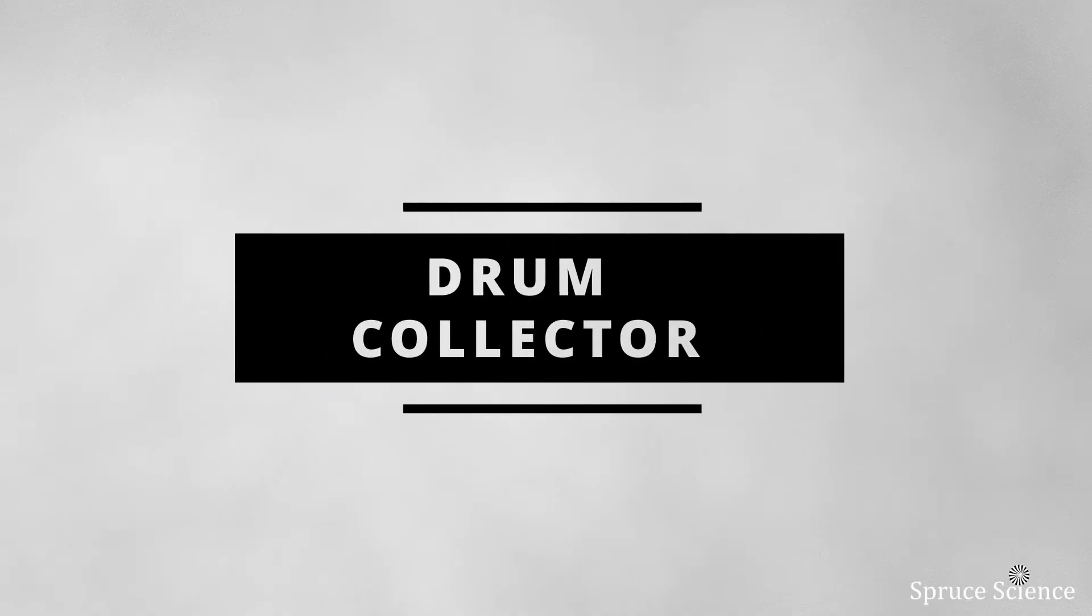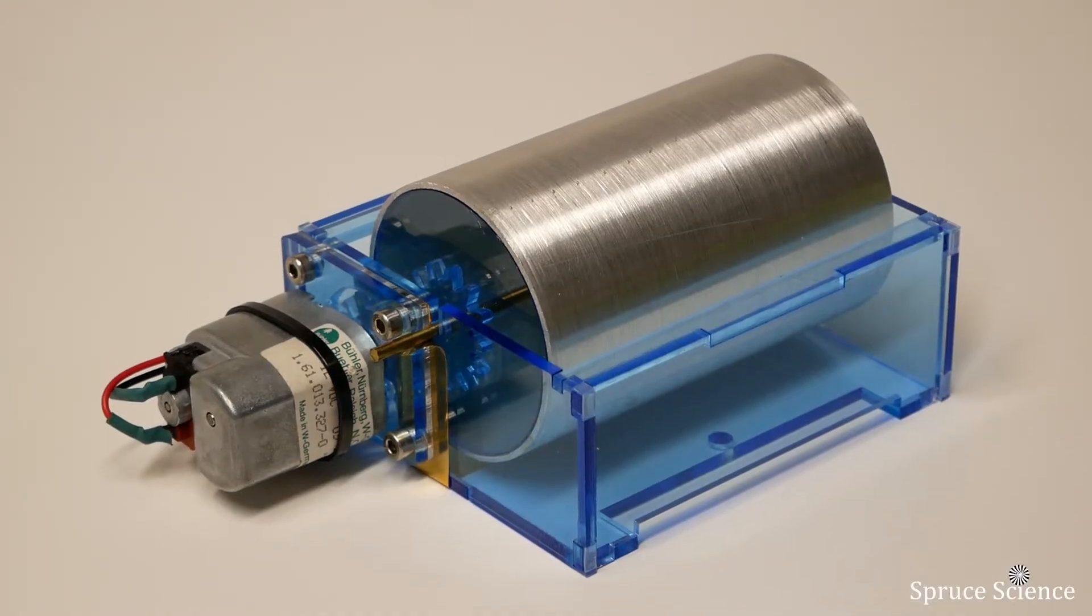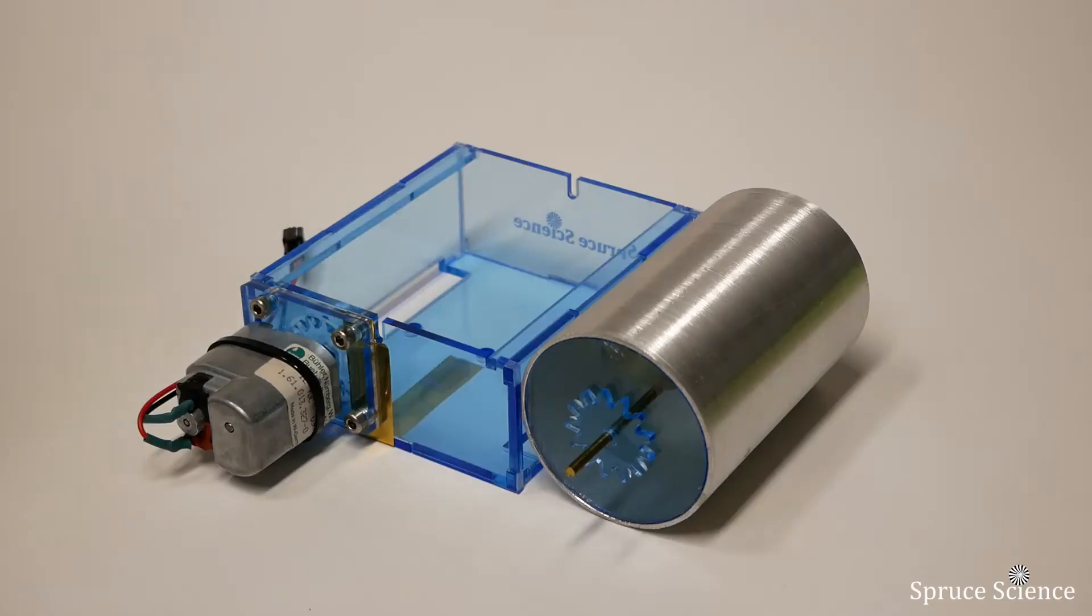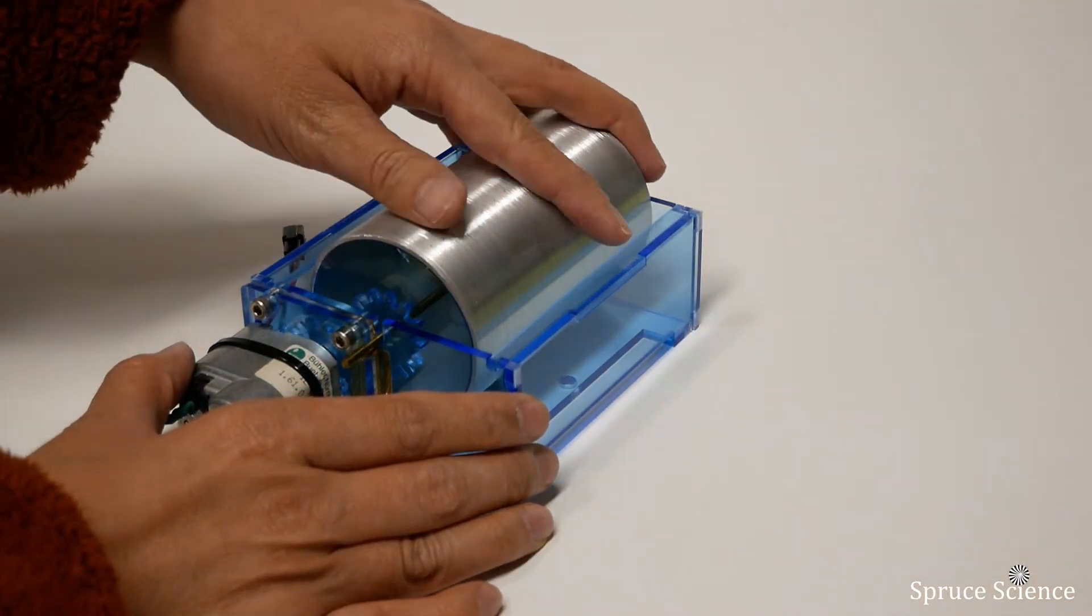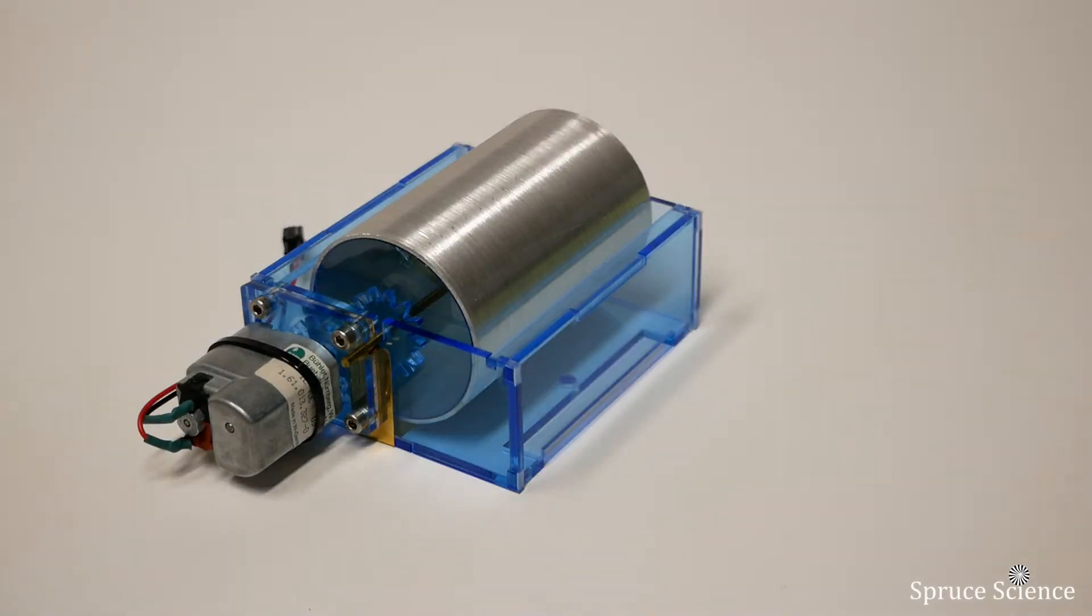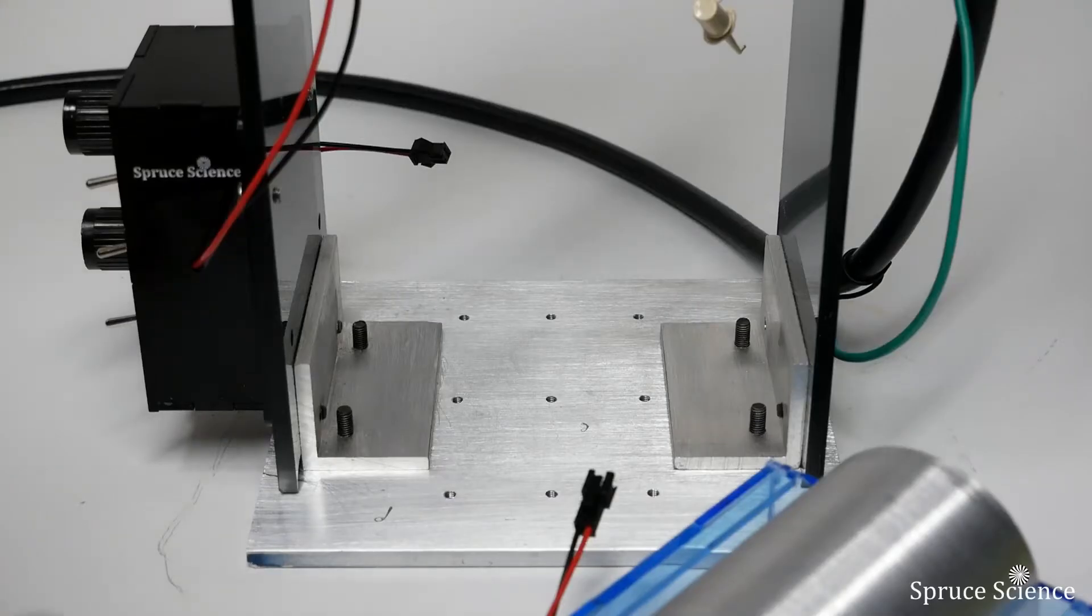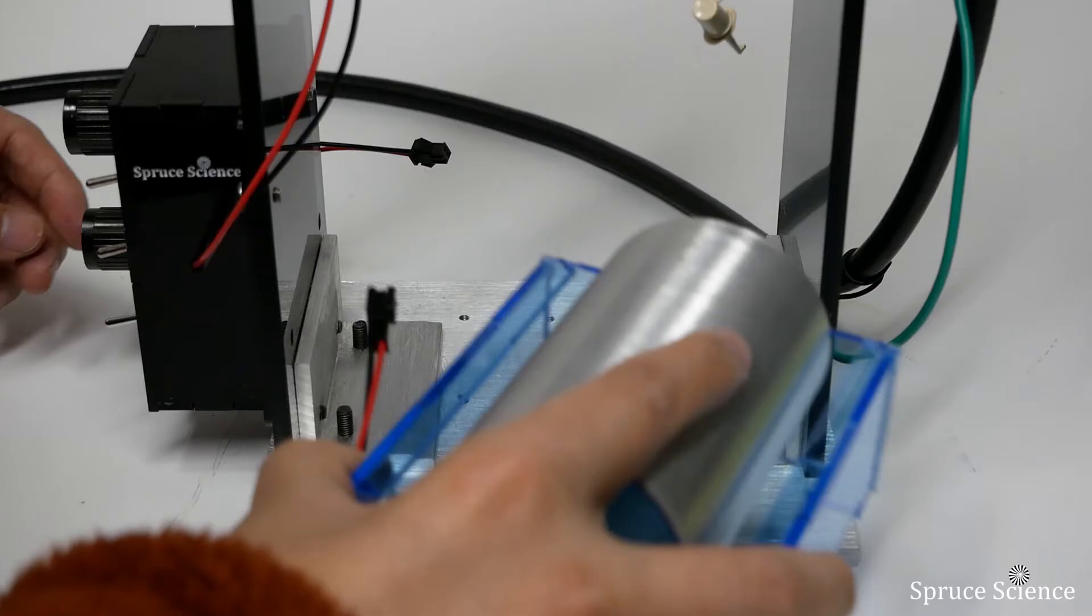Let's first go over the drum collector assembly. The drum collector is detachable and it is driven by a DC motor. To install the drum collector, align the gears and insert it gently in place. Place the collector assembly on top of the aluminum base.